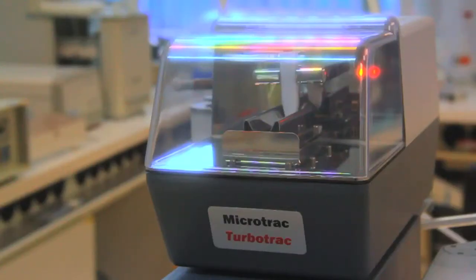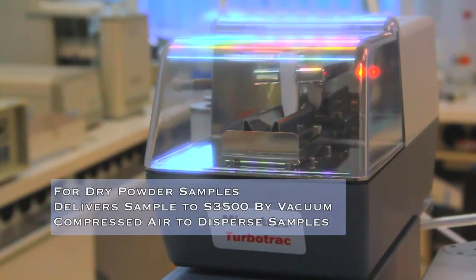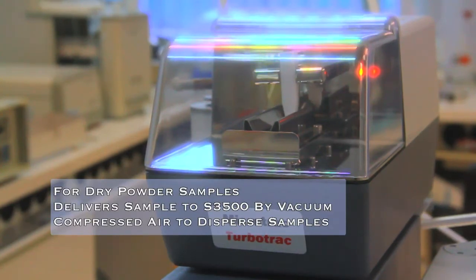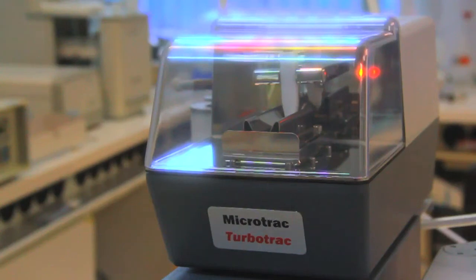The Turbotrac is a dry powder dispersion system that delivers a well dispersed powder sample to the S3500 for analysis. The powder is transported to the S3500 by vacuum and compressed air can be used to disperse highly agglomerated powders. The degree of dispersion can be controlled by pressure and inductor gap settings.